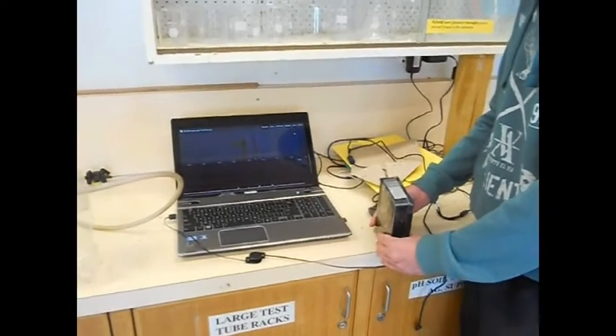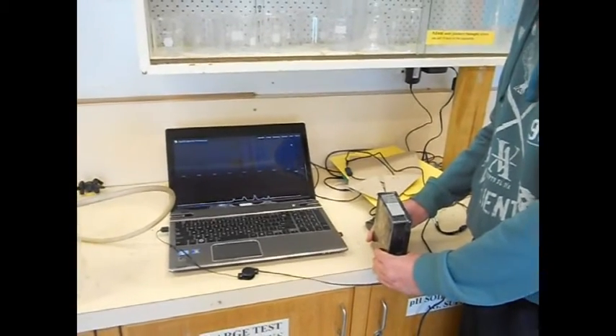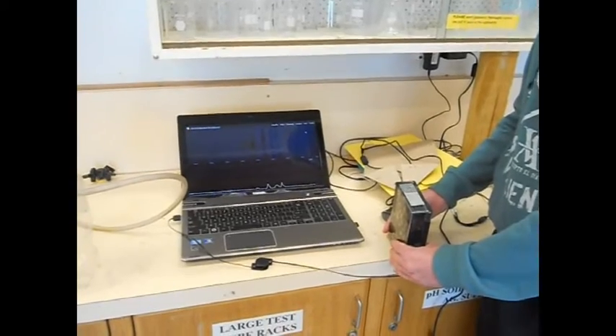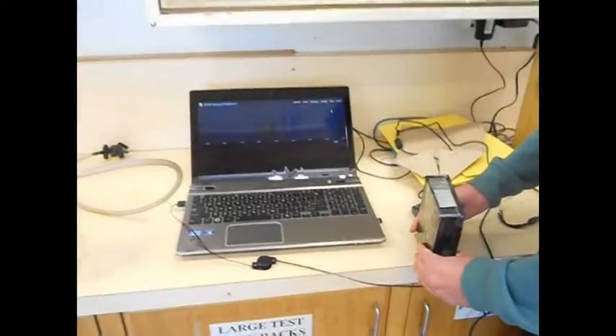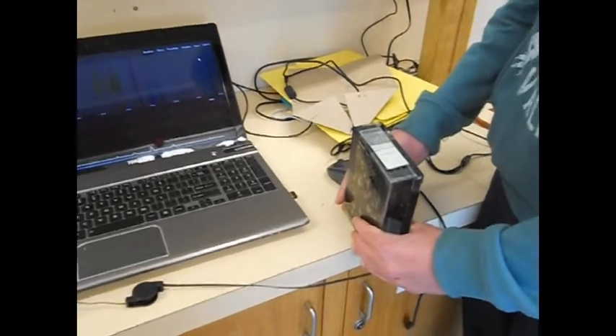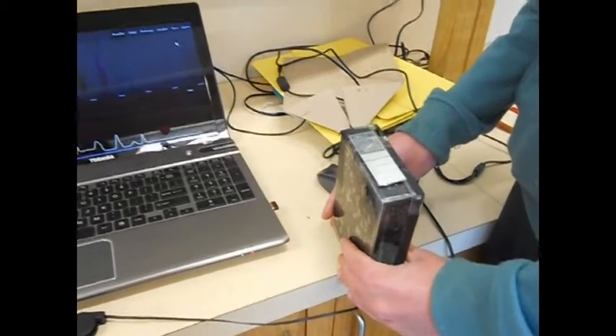This is the PLOTS Public Laboratory Spectroscope Project. Here we've got a setup where we are calibrating the spectroscope. The spectroscope is being pointed vertically upwards at a fluorescent light, and that's producing the spectrum that you see on the screen.